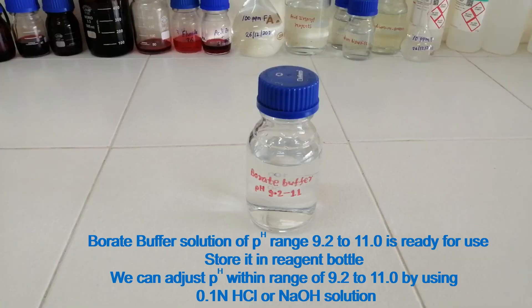Borate buffer solution of pH range 9.2 to 11.0 is ready for use. Store it in a reagent bottle. We can adjust the pH within the range of 9.2 to 11.0 by using 0.1 N hydrochloric acid or sodium hydroxide solution.